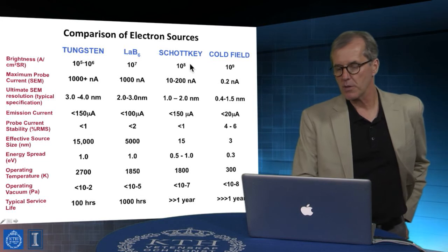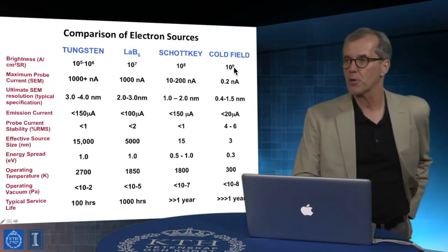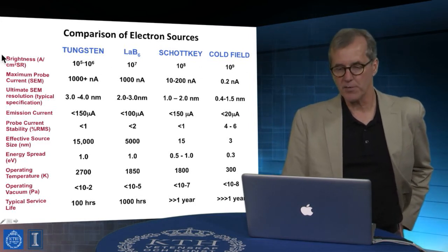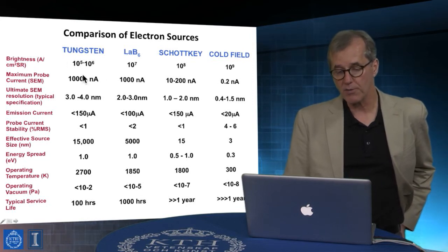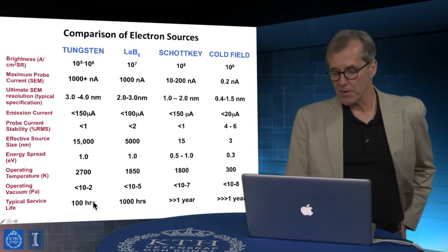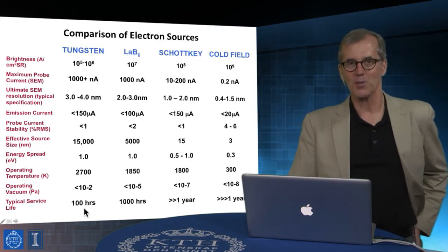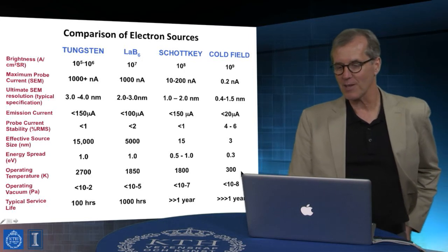And actually a way you can read the top of this is how expensive the microscope comes to be. Here being very expensive, and here being relatively low performance, but actually very low cost instruments. Another part of this is that these are very survivable instruments to mishaps that students tend to do with instruments, and these are very much less so.